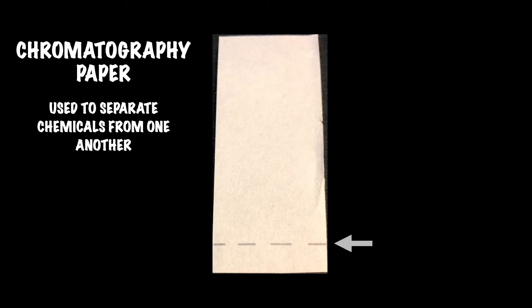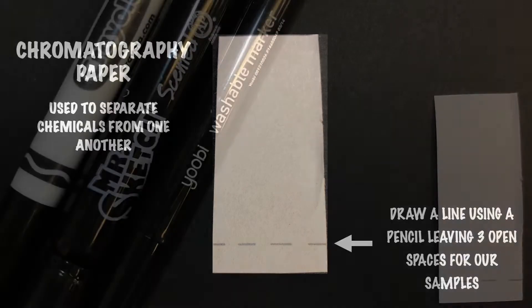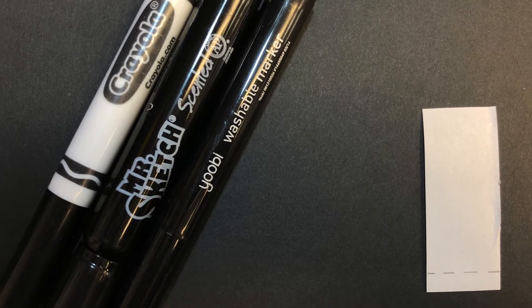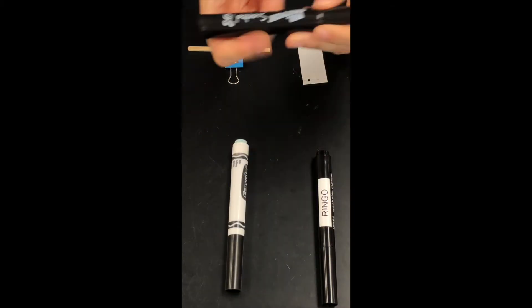Along the bottom, we've taken a pencil and marked a line, and we've left three spaces where we're going to dot our samples. In this case, our samples are our three markers, so we're just going to put a spot of each marker in each of those spaces.